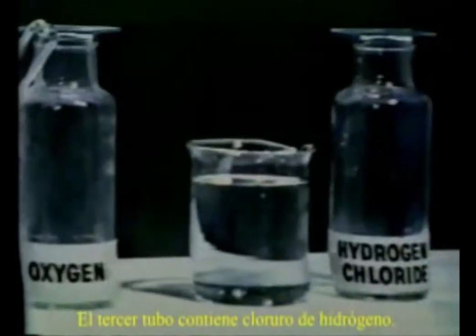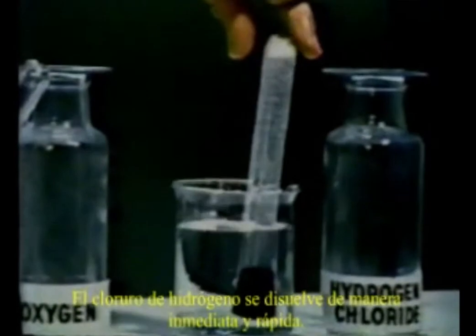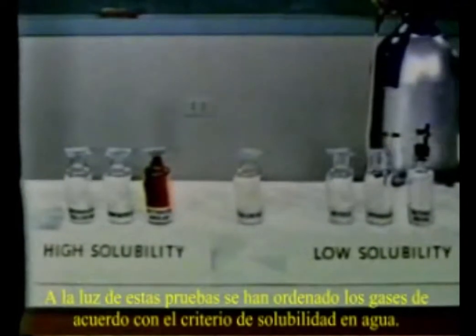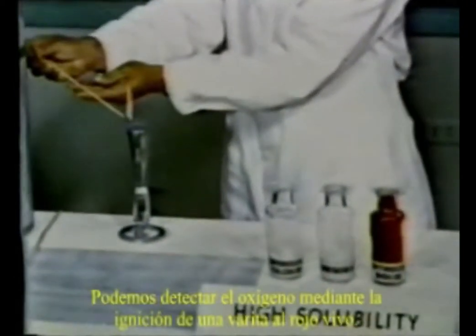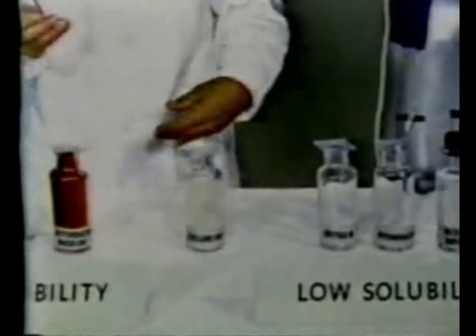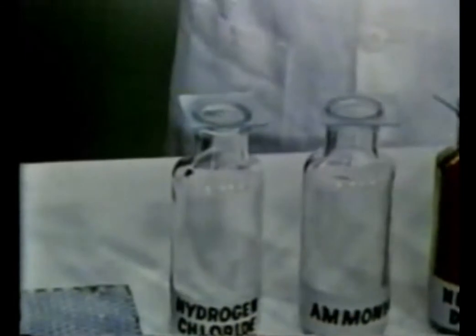The third test tube contains hydrogen chloride. Hydrogen chloride dissolves readily and rapidly. On the basis of such tests, we have grouped the gases according to their solubilities. A test commonly used to identify oxygen is the ignition of a glowing splint. Perhaps we can use this familiar test as a basis for further segregation of these gases.